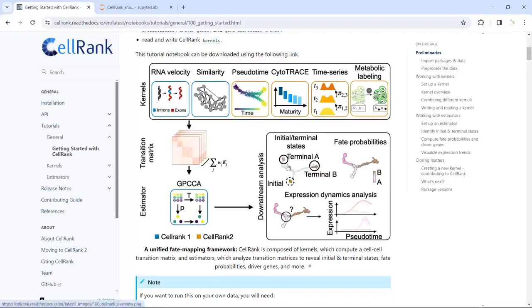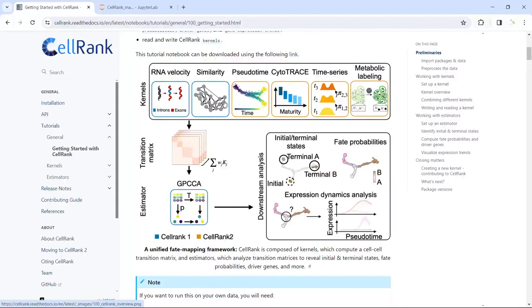Here is the workflow for the CellRank package. CellRank requires you to use other packages to analyze your single-cell RNA sequencing data — for example, RNA velocity using the scVelo package. Once you analyze your data using different packages, you can set up one of six different kernels to compute the transition matrix. Then we can use the transition matrix to study cell initial and terminal states, fate probabilities, and gene expression trends.